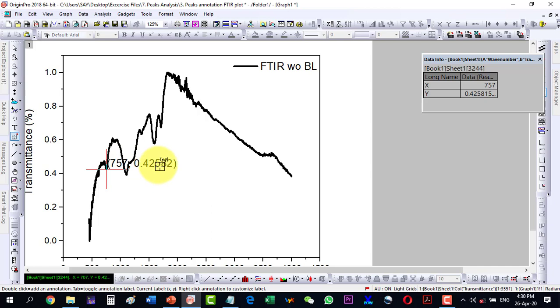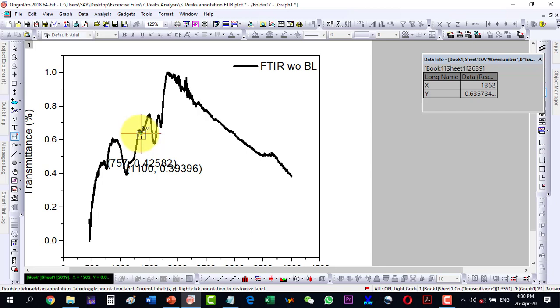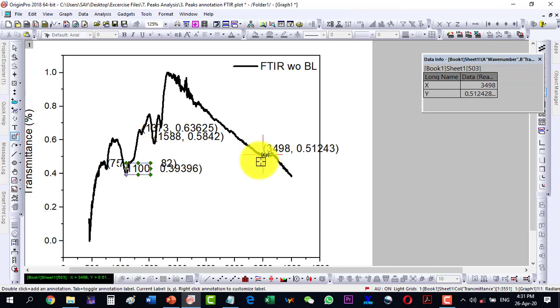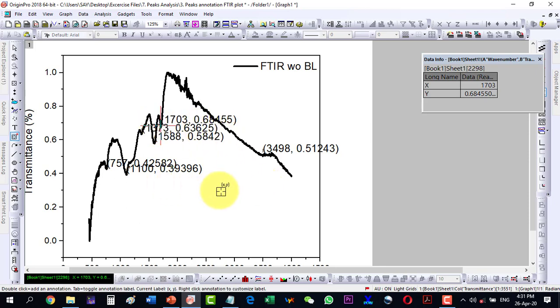With double-clicking it will annotate the x and y values, and later on I can change them. I place the cursor at the right location, click once, then double-click, and it will show the x and y value. I repeat this for each peak of interest — clicking at the right location and double-clicking to paste the value at each one.